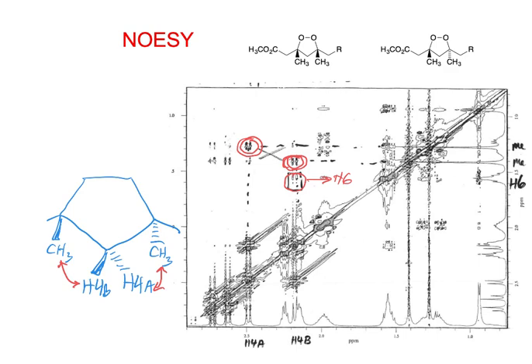For this, you had to get really close to the baseline to see it. You can see it's pretty noisy. I don't think there was a lot of sample, too. That doesn't help. So what we do see is these noise lines going up and down here. From these methyl groups, they're going up like this, and then there's these weird things going like this.